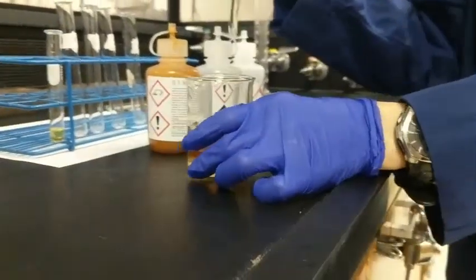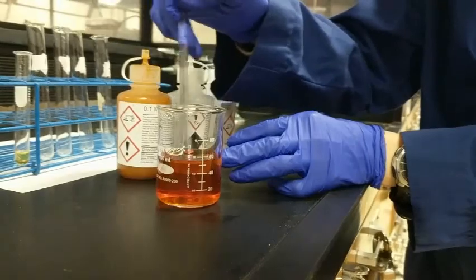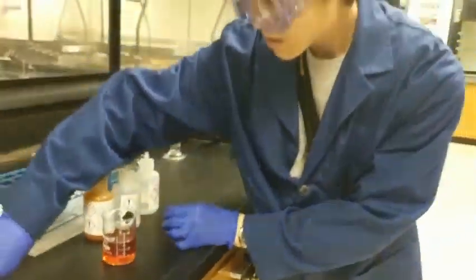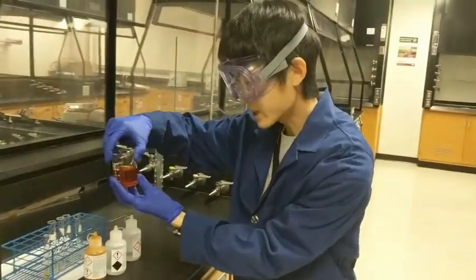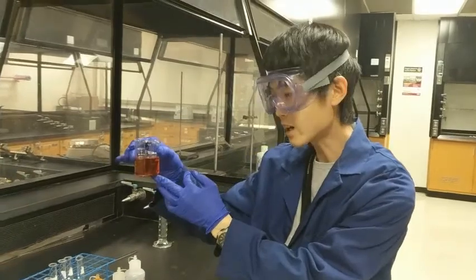Using a glass rod, just gently mix it together. As a final product, we have a solution of a dark reddish color.